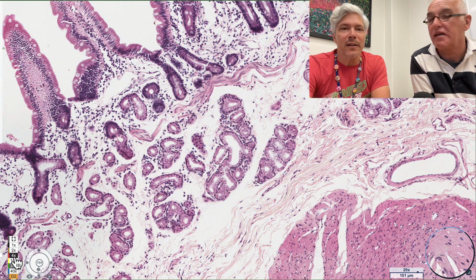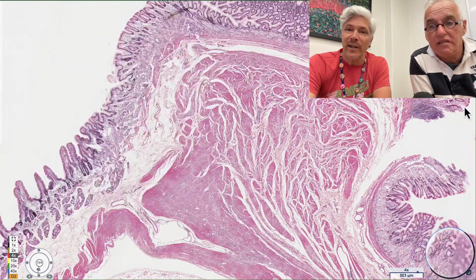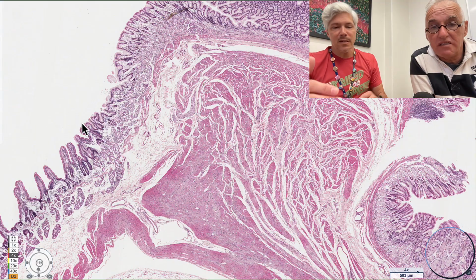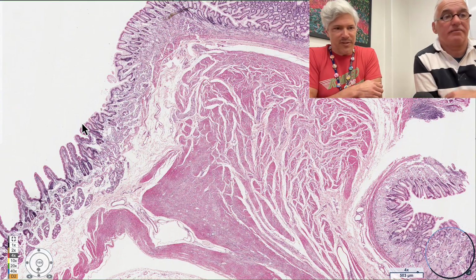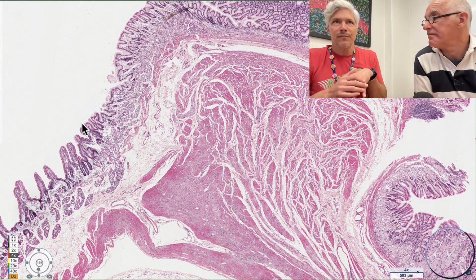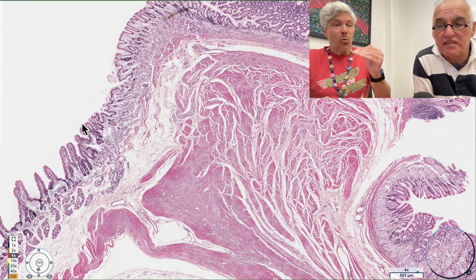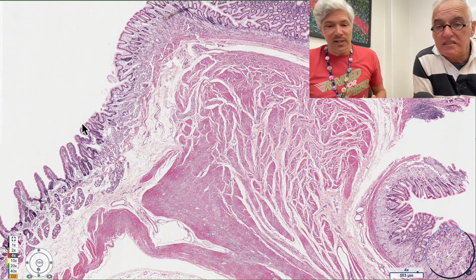Oh, I almost forgot. If we go back to 4X and look at this, over this large ridge here, we have the acidic contents of the stomach spilling into the duodenum. We had taken food that was at whatever pH it was, in different diets it can range from 5 or 6 to 8-ish. We had stepped the pH down to like 1.5, super acidic in the stomach. That kills off a lot of potential pathogens.